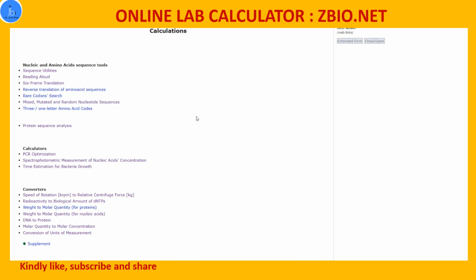If you have already done some tasks in the laboratory, you have the idea that many a time we have to convert these oligonucleotides, we have to calculate things related to spectrophotometry, about getting the ideas about the quality of proteins and nucleic acid, and then you have to run a centrifuge. Depending on the machine, sometimes it will run in RPM and sometimes in kg. So you have to convert all these things, and then molarity calculations, you have to convert weight to the molar quantity. So we will convert all these things here.